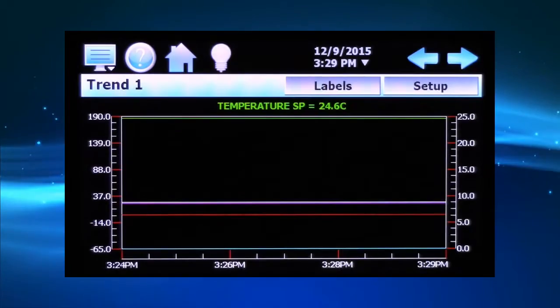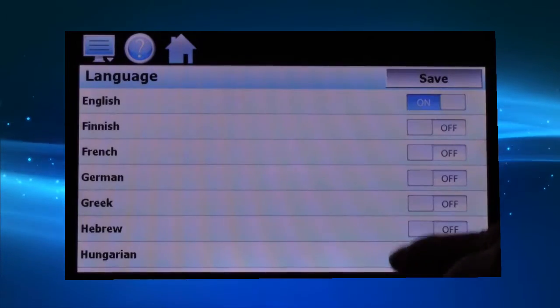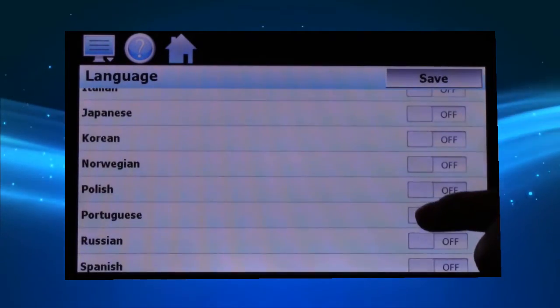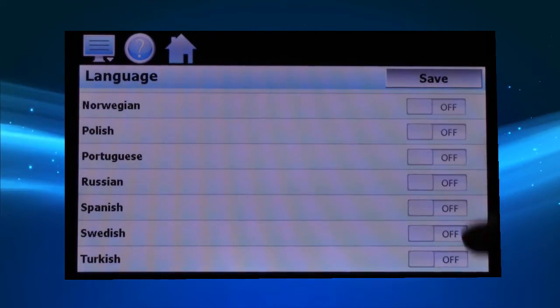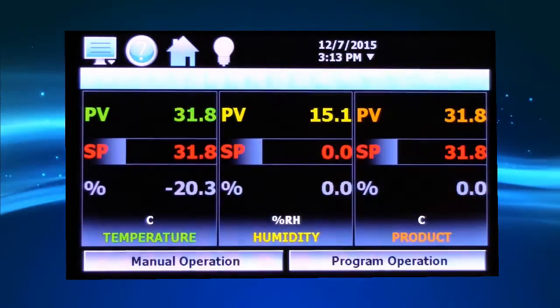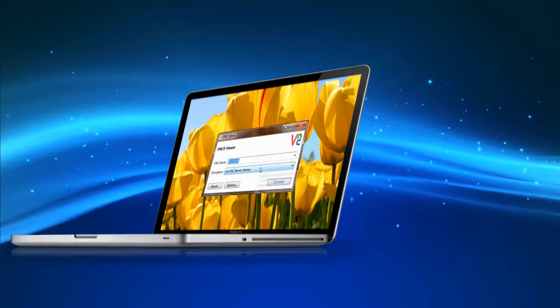The trend graph can plot temperature and humidity on the same graph using left and right axes. Choose from 28 available languages — one setting updates icons, menus, and help screens.